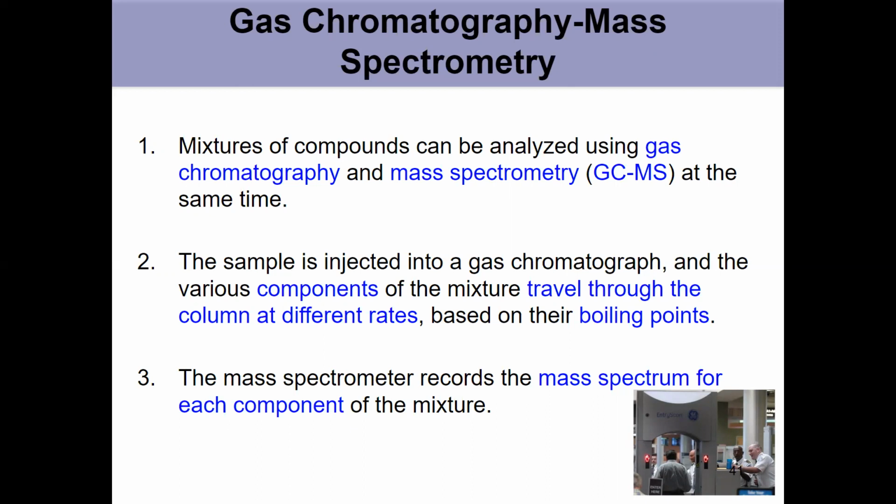Really common instrument. It's used in forensics, it's used in airports, all sorts of different applications, commonly found in labs as well. So just be aware that that exists. These fragmentation patterns and isotopes wrap up mass spec in 2 videos for us. For the rest of chapter 13, we will move on to IR and UV vis, but make sure before we get into that, you use video 1 and video 2 from chapter 13 to fully understand mass spec.